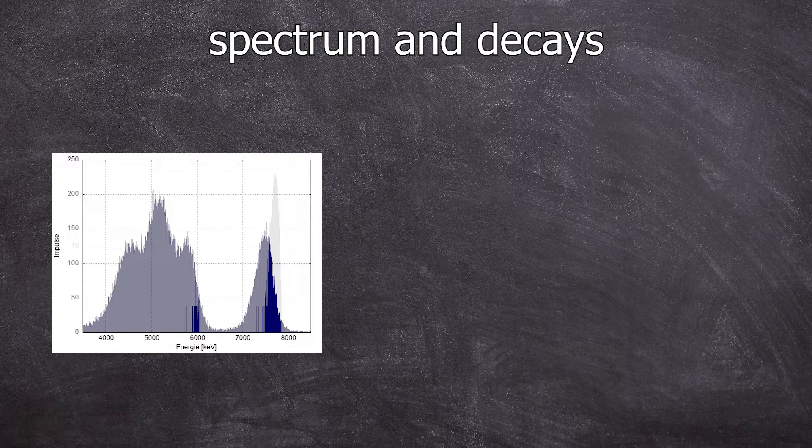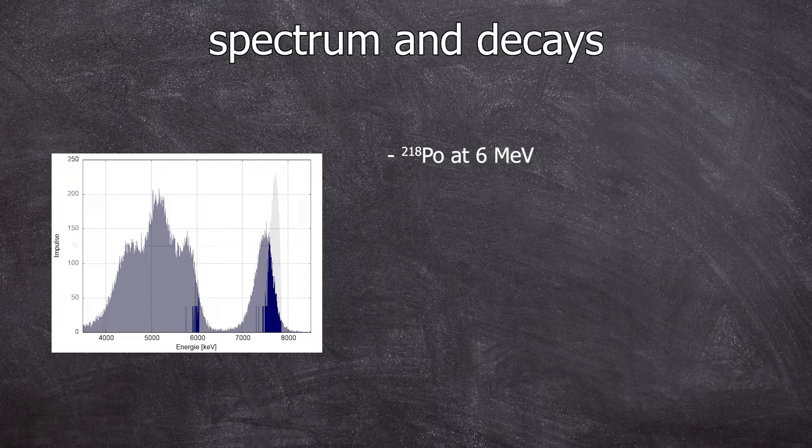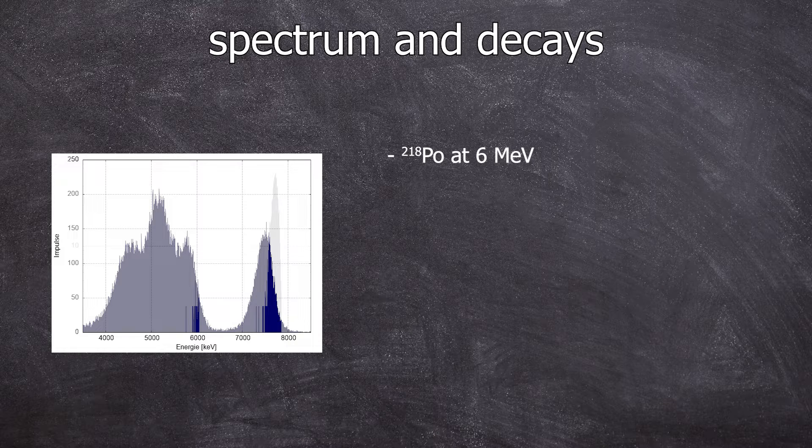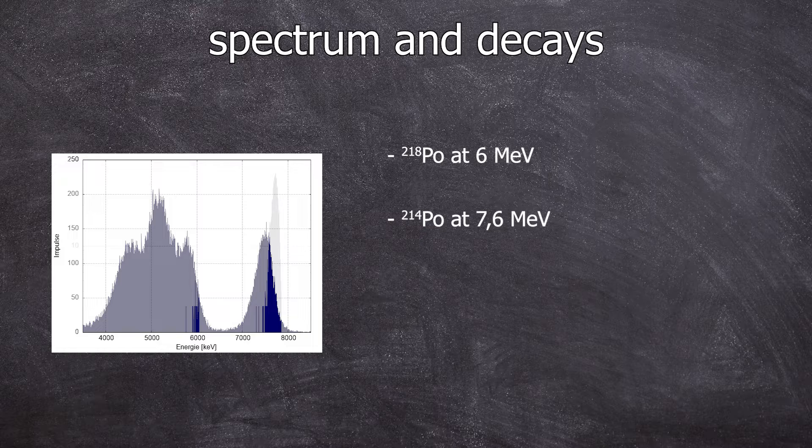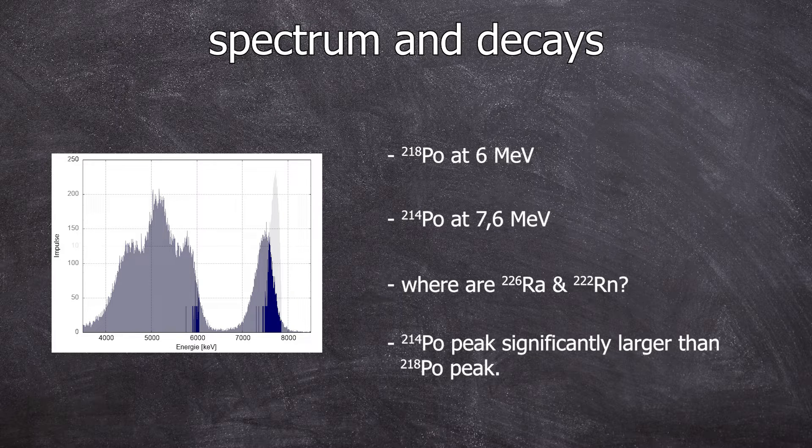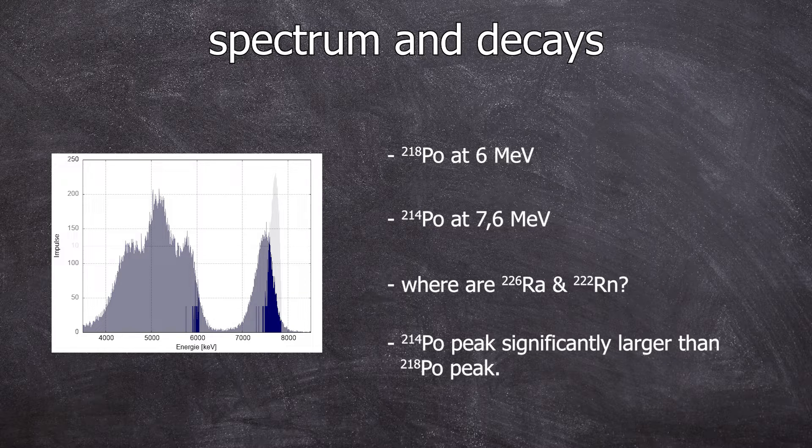These two signals should look familiar. It's polonium 218 at 6 mega electron volts and polonium 214 at 7.6 mega electron volts. But here you can clearly see differences. Two radionuclides are missing and the polonium 214 peak is much larger in comparison. Now we gotta figure out why.